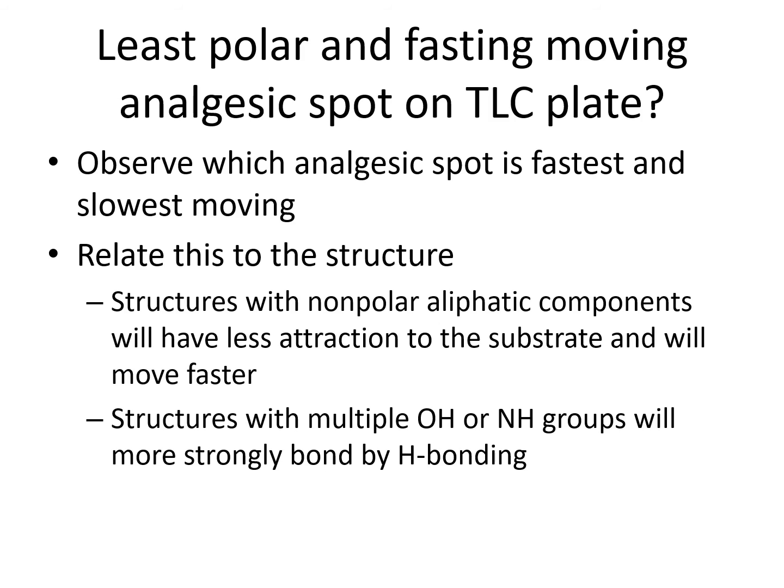So how is the mixture going to be separated? Because these compounds have different polarity, they will have different interaction with the stationary phase and with the mobile phase.